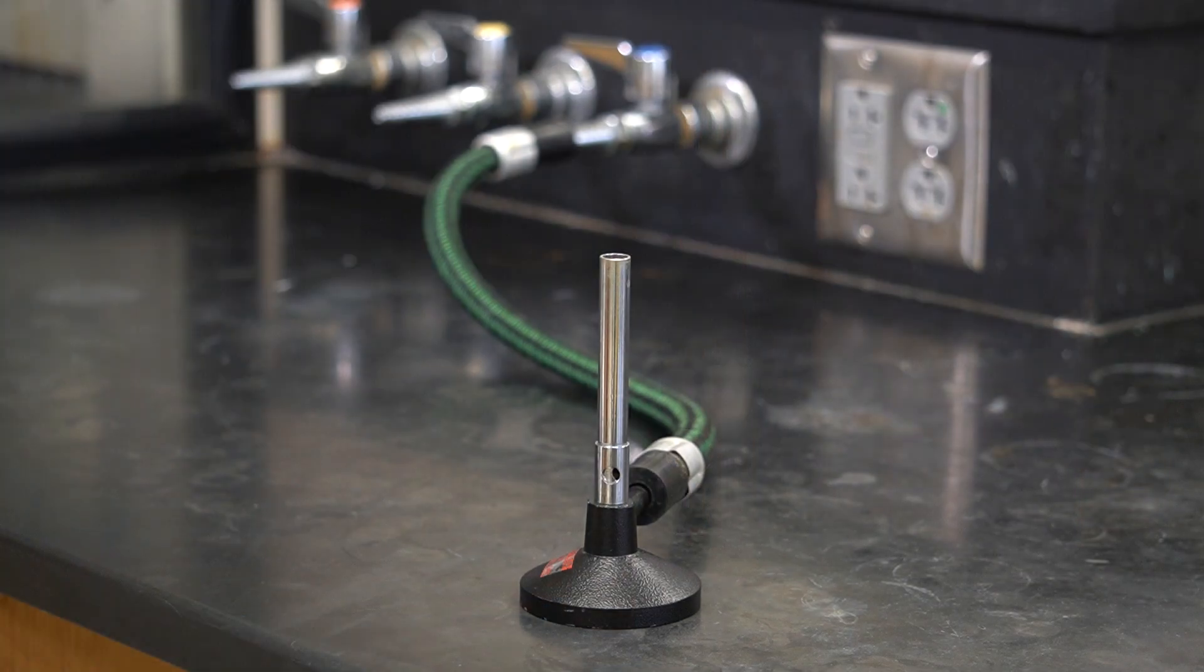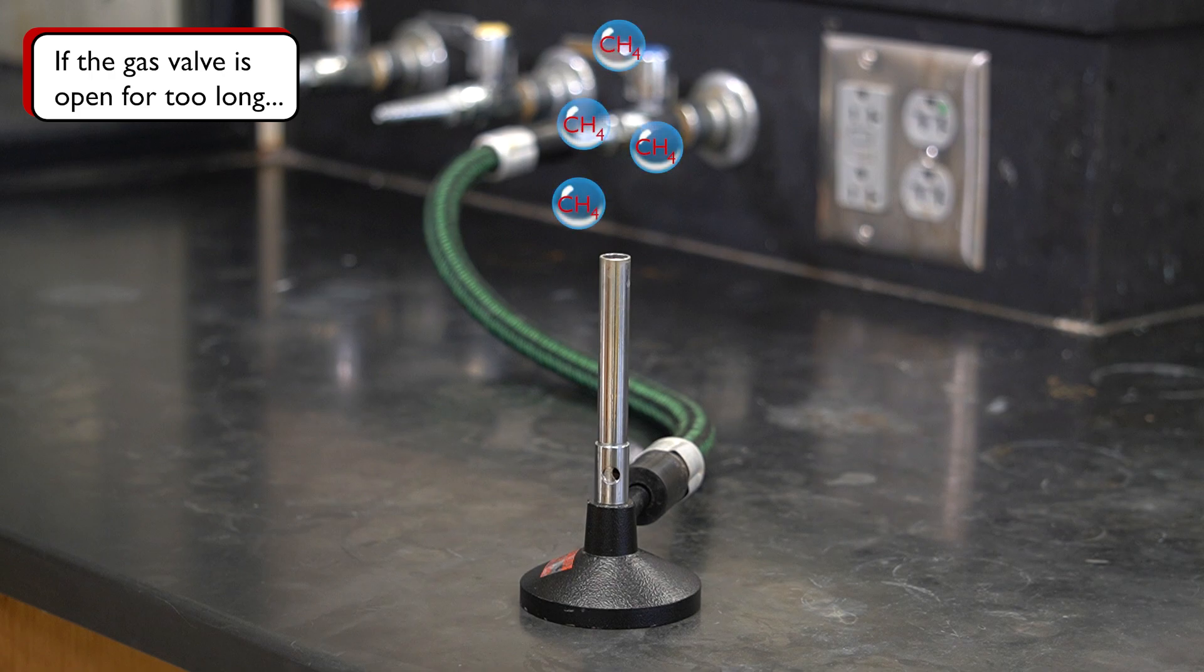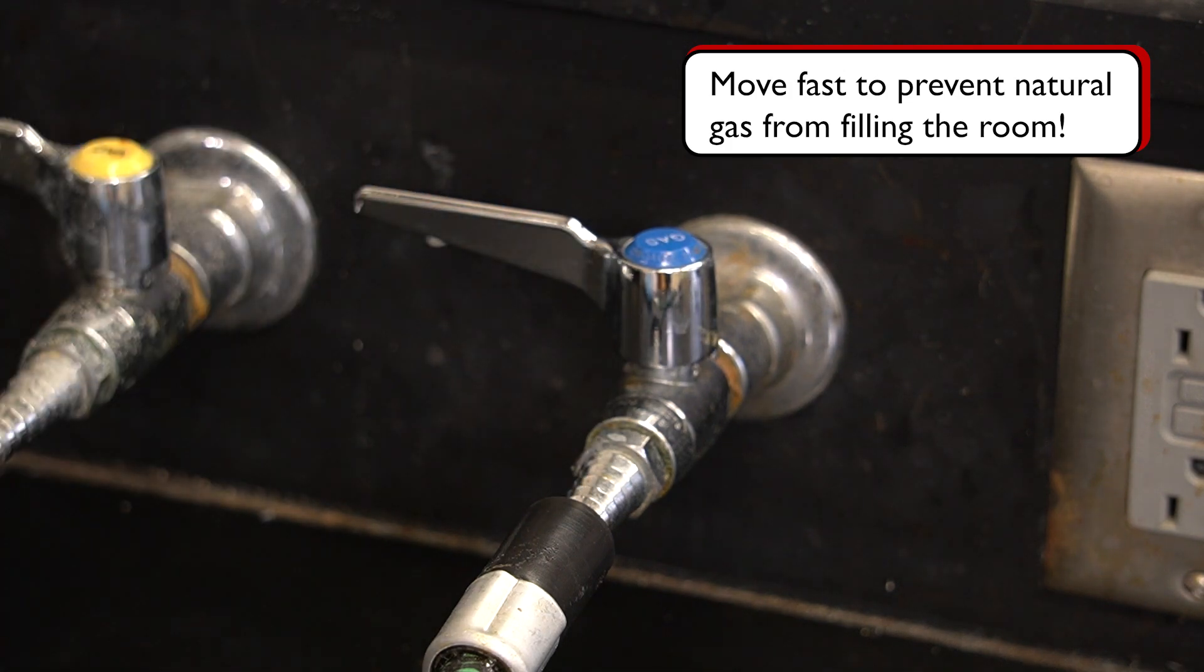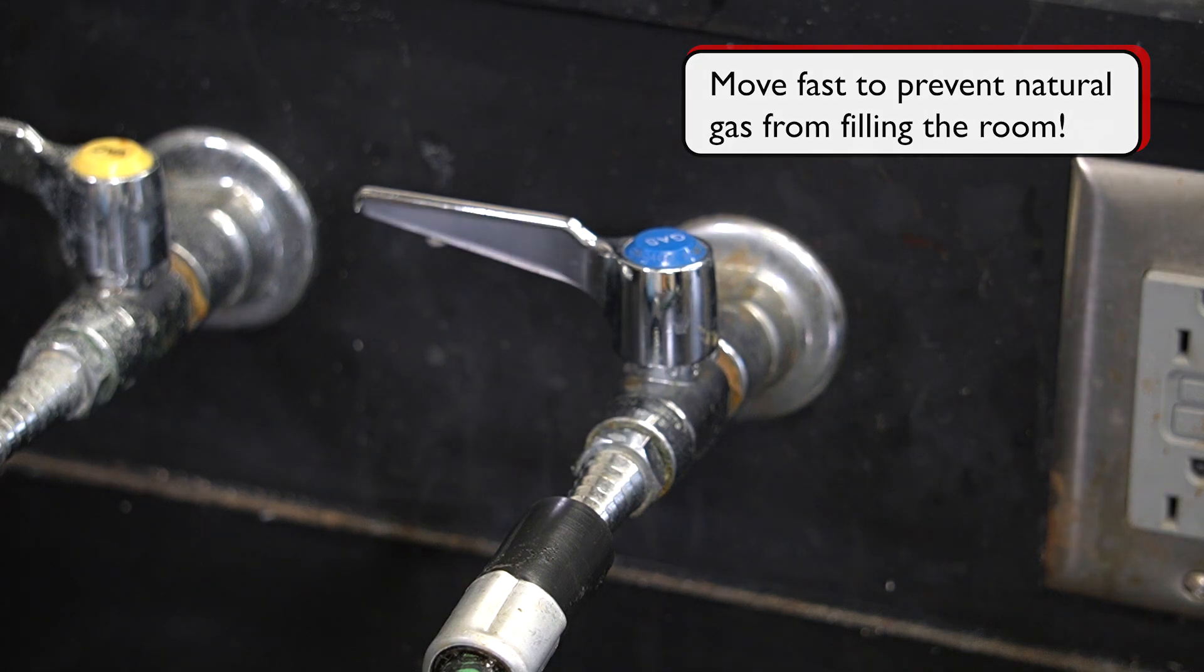For the next few steps, it is important to move quickly. Leaving the gas valve open for too long will fill the area of the lab with flammable gas, which is a safety hazard. If the gas has been on for too long, turn off the gas and wait until the gas has had a chance to diffuse into the room, at least 10 seconds.